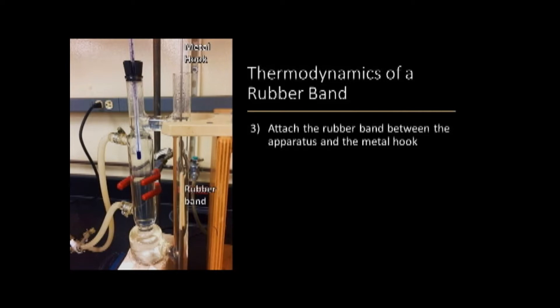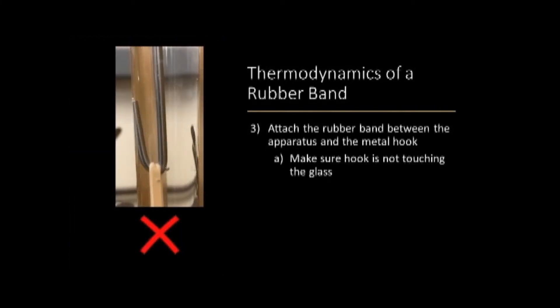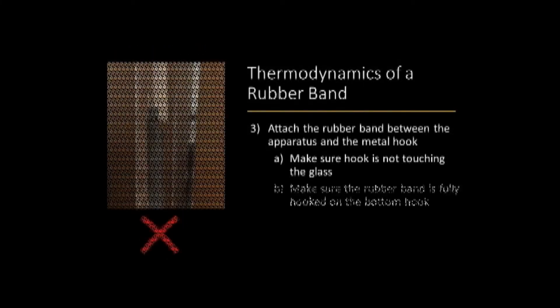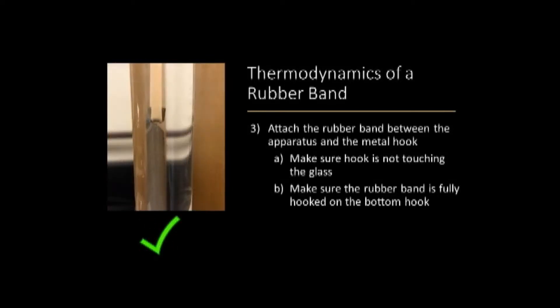You will then attach the rubber band to the apparatus and the scale using the metal hook. When doing so, make sure the hook is not touching the glass as shown in these two images. Also make sure that the rubber band is completely hooked on the lower attachment of the apparatus as shown here.